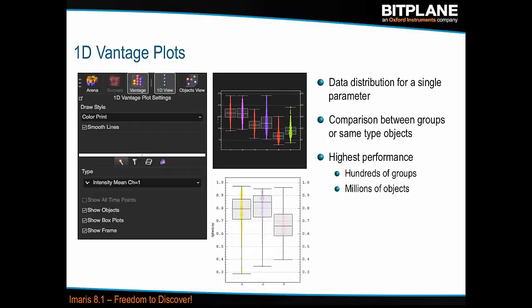So if in Surpass you have problems loading and visualizing complex data sets, you will have the same problems or even worse in Vantage, because Vantage will actually allow you to look at many images, not just one image. And if you have all the data loaded there, all the surfaces, all the filaments, and all of this, it will require quite a hefty computer to plot all of these 3D rendered objects.